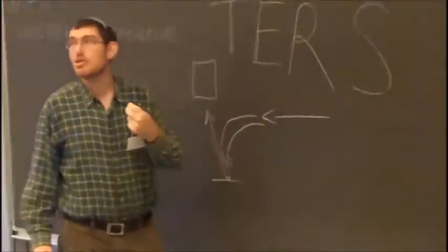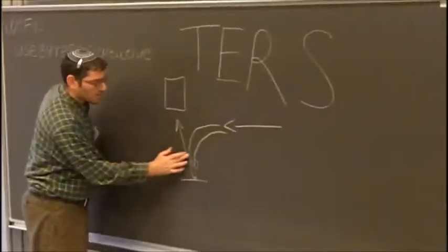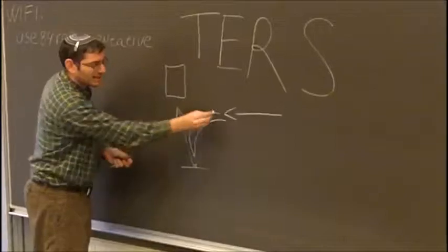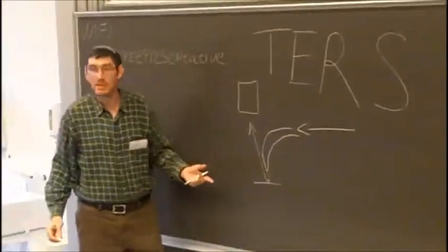It's apertureless. So we have here a regular probe, which is not a conducting probe. It's a glass probe, for example.